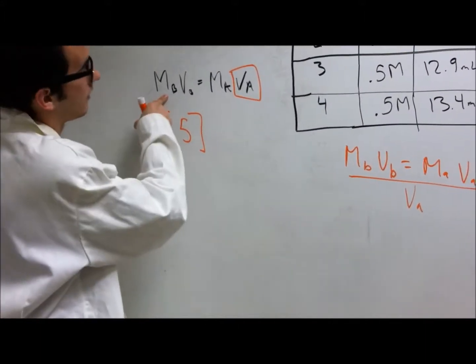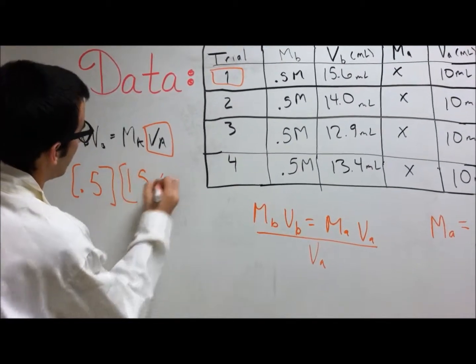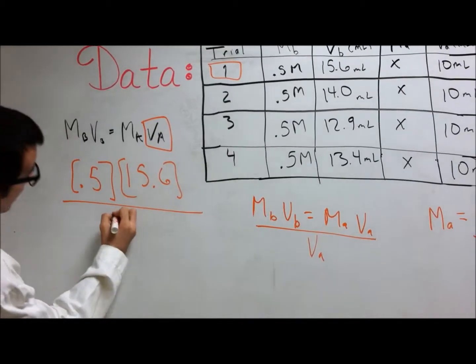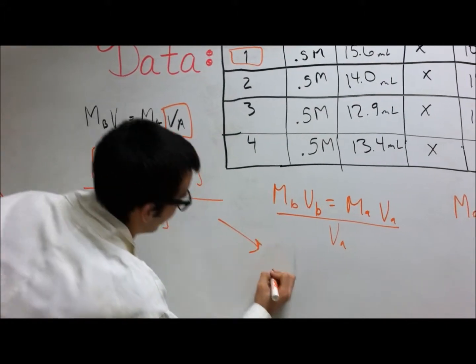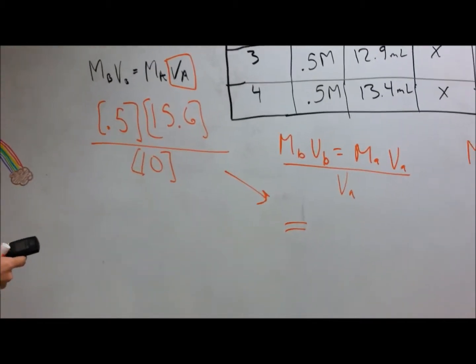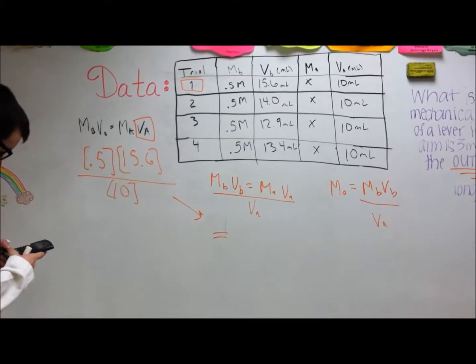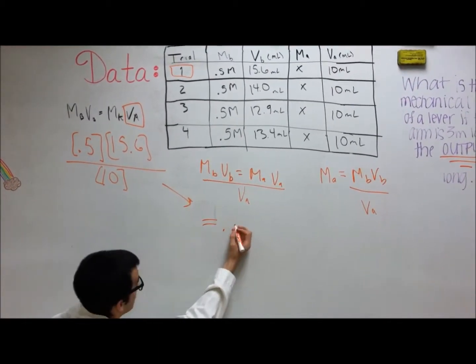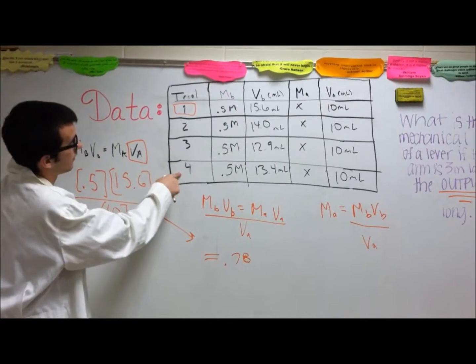So we have a 0.5 molarity of the base. We use 15.6 milliliters of the base. And we also had 10 milliliters of the acid. Sorry that's a little messy. I need a calculator. So when I solve this out, I know that the molarity of the acid is equal to 0.78. And now I will repeat this for all 4 of our trials.